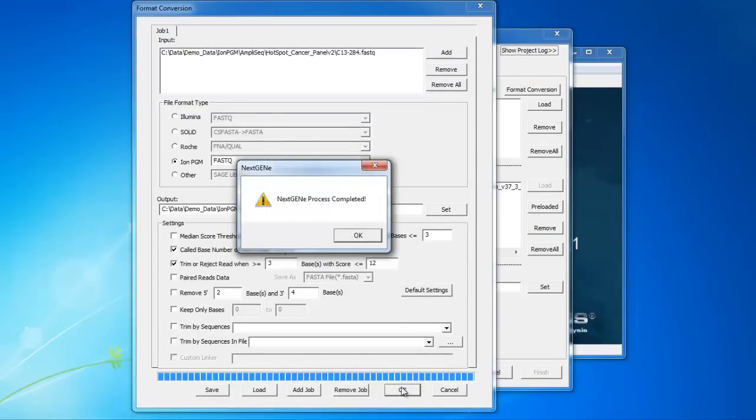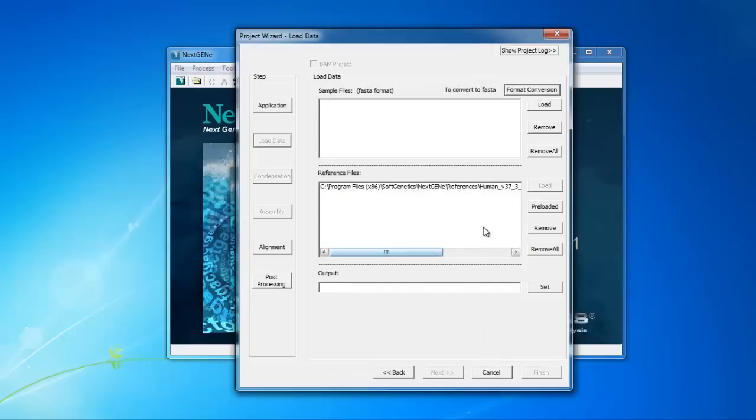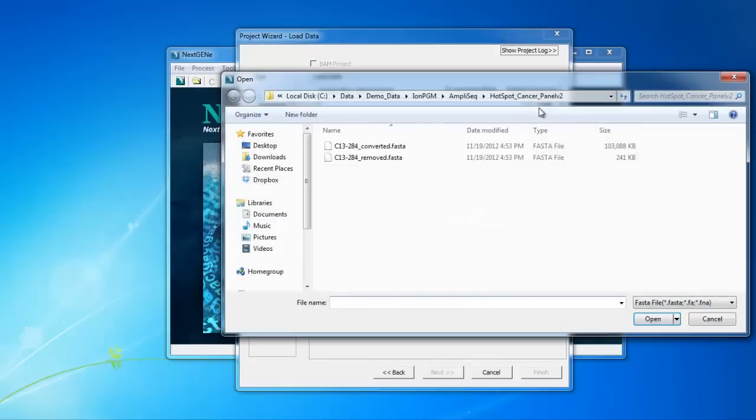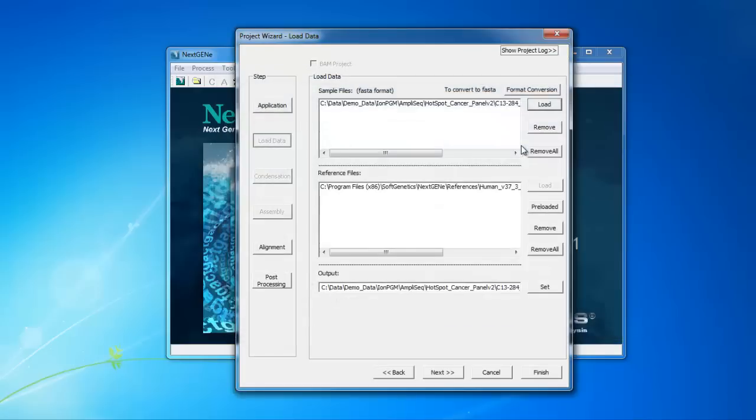Click OK to begin the conversion. When the conversion is complete, the Process Completed message is shown. And we can now click Load to browse to and load the converted FASTA file.